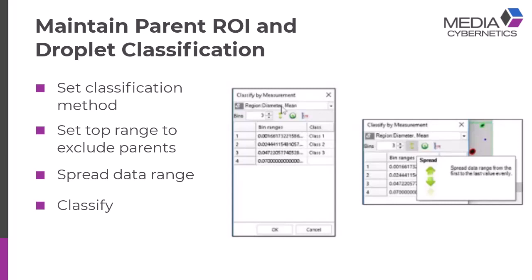The second step is, after we have excluded it, there's a feature in classify by measure, or single variable class, spread data range. If no one's ever used it, there's this little double arrow here. What that means is, once I've set the min max, redistribute along those ranges. This will do an even distribution. Or I could actually, if I have by my standard operating procedure, maybe I have defined ranges here, you can enter those in instead of using the spread button. But basically, this will redistribute those values evenly within here across a number of bins. And that's what this double arrow does. And then, press OK to classify the data.